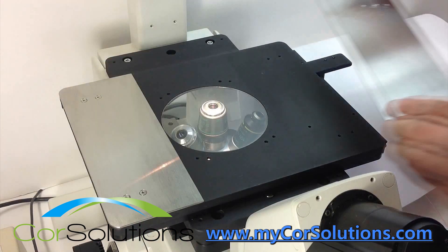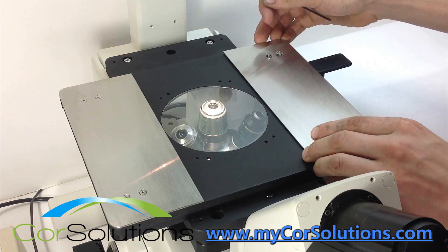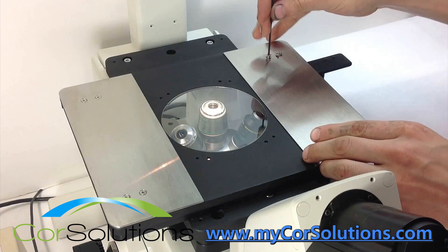A magnetic probe kit designed for use on a microscope stage is available, as well as a standalone optical breadboard table.